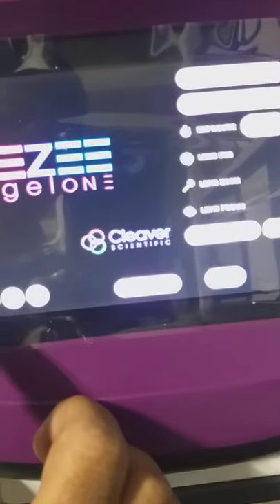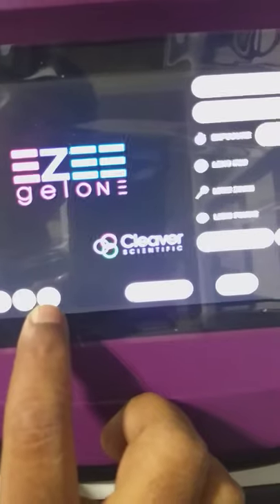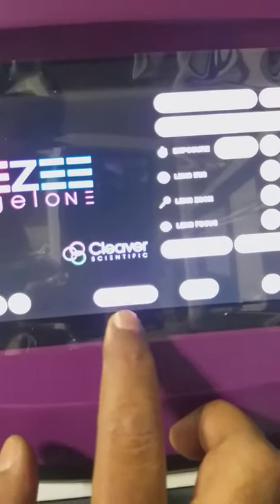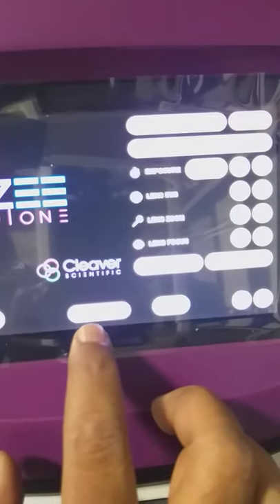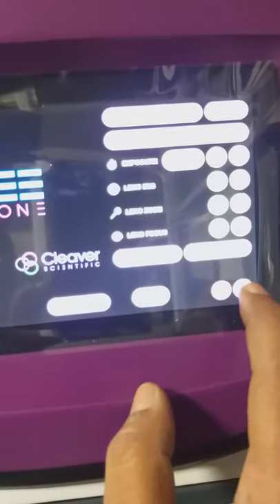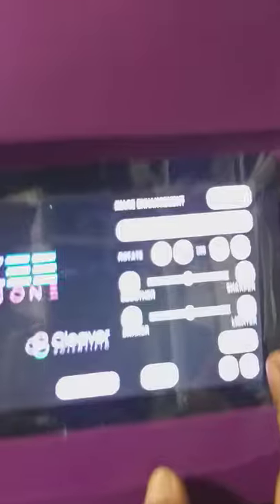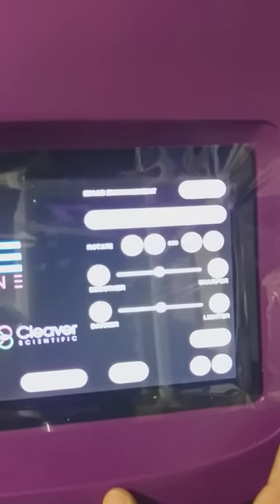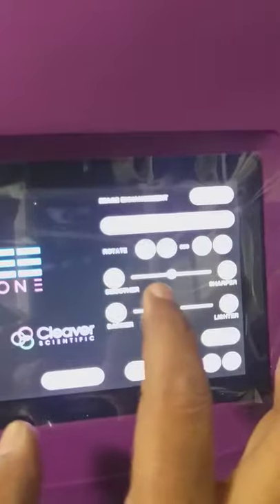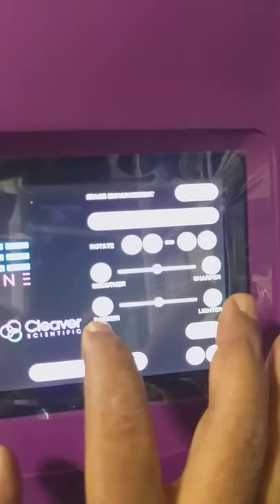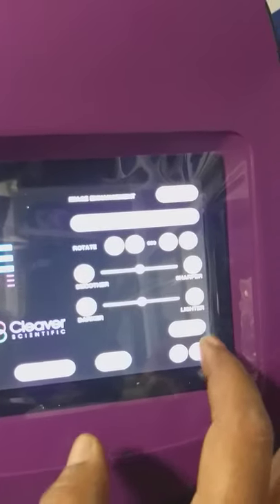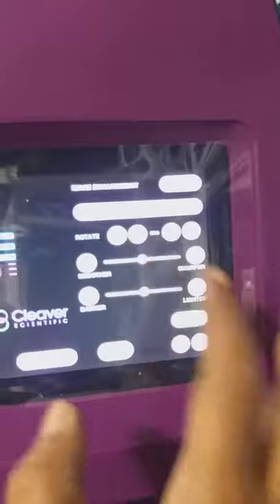So if you are not required zoom, you can press it into mark. Then saturation — so we can adjust the saturation of the picture. You can push in that. After then comes to next settings. This is the inverter which includes all camera settings. If you want to rotate the picture of the gel, you can smooth and sharpen and darken and lighten.